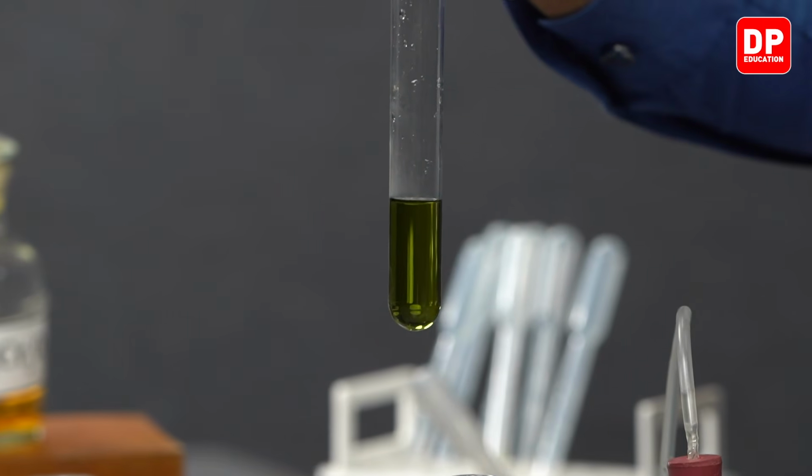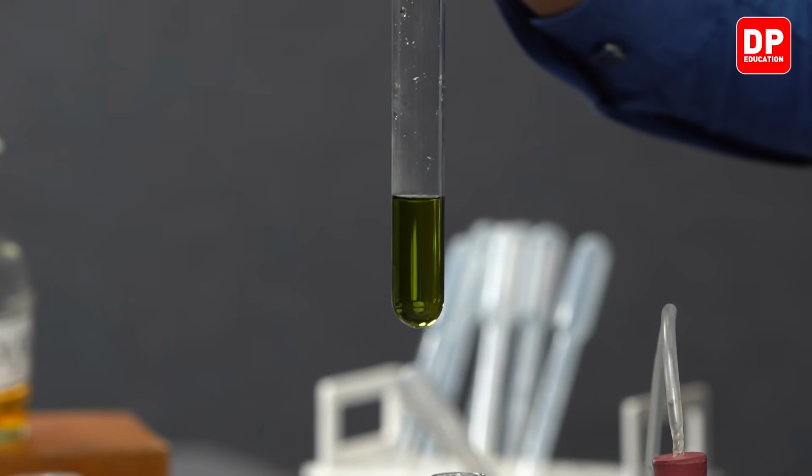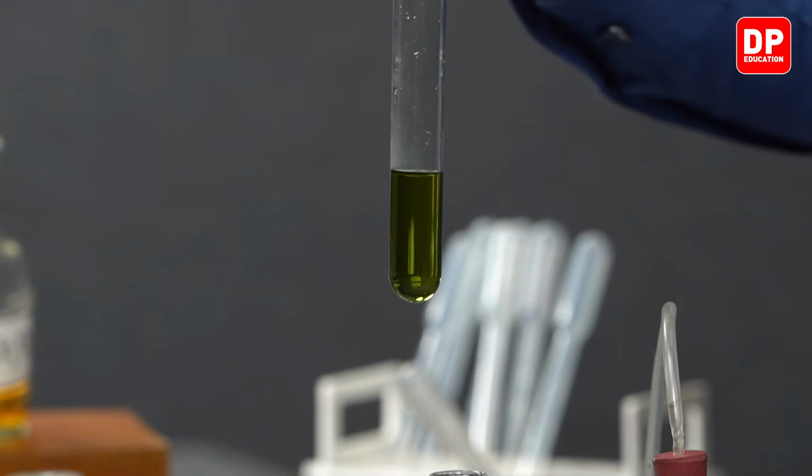We took sodium sulfite here, and when we reacted it with hydrochloric acid, sulfur dioxide gas was produced. To identify the sulfur dioxide gas that is produced, we can send it through acidified potassium dichromate. We observed that when we send it through acidified potassium dichromate, the orange dichromate solution turned into a green chromium 3 plus aqueous ion solution.